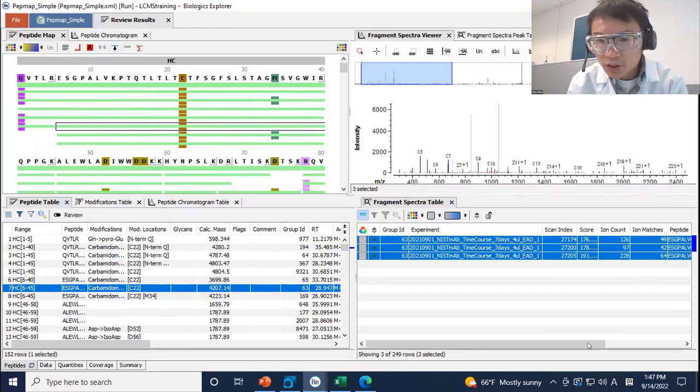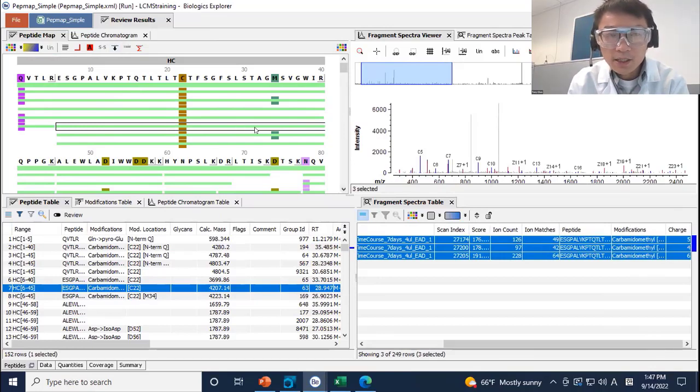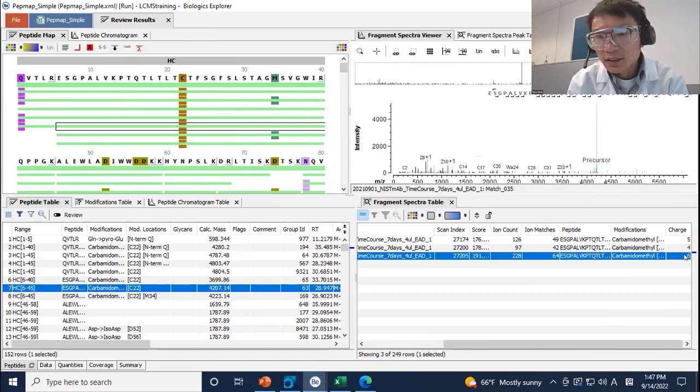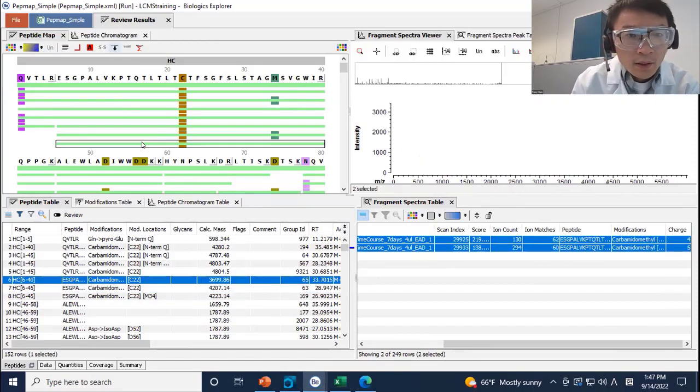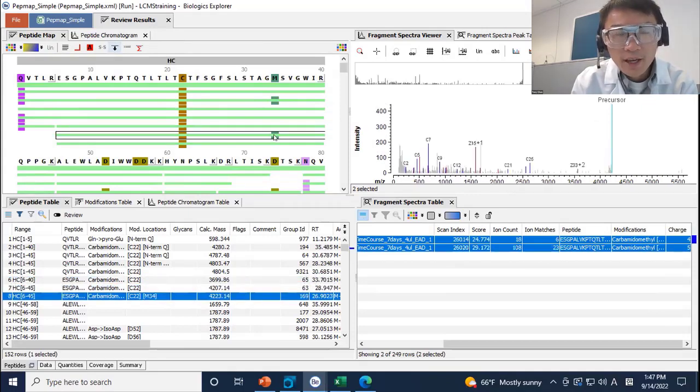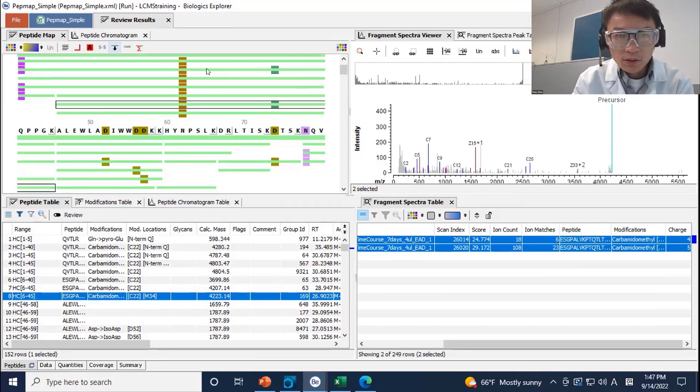And at the bottom here, it is showing the different charges. For example, for this identified peptide, charge 4, charge 5, and charge 6 are confidently identified. And because for each peptide there can be some variants, for example the peptide without PTM and the peptide with PTM, here we have a methionine oxidation, all the different peptide forms will be showing in this peptide map table here. So that is the peptide mapping table.